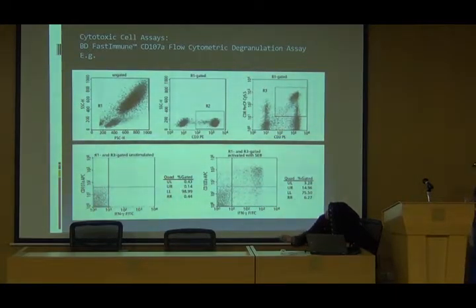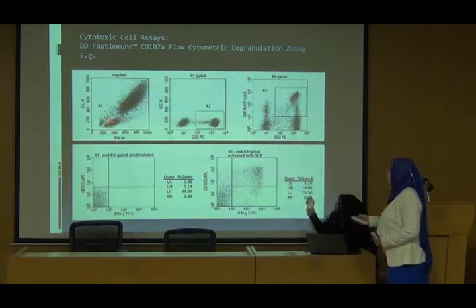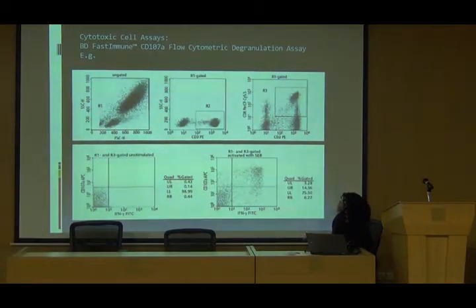This is a neutrophil. This region is where the monocyte is, less complex but bigger than the lymphocyte. Lymphocyte is the smaller, the first one here. So if I am interested in any of, say, T cell, B cell, natural killer cell, I get the lymphocyte region. From this gate, I design another plot.